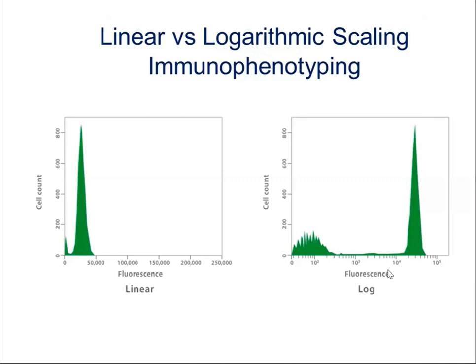basic enumeration assays, see, for enumeration, you use the beads, right? Yes, sir. So beads basically will give you the count. Normally beads will not, I told you this, beads will not take up a fluorescent space. It will never take up a dedicated channel. The enumeration beads are designed in such a way that they will be bright for all the channels. So every channel has it, but it will not interfere with your data because it is very bright and it falls somewhere outside. So it will not interfere with your analysis, and you don't have a dedicated channel for enumeration beads.